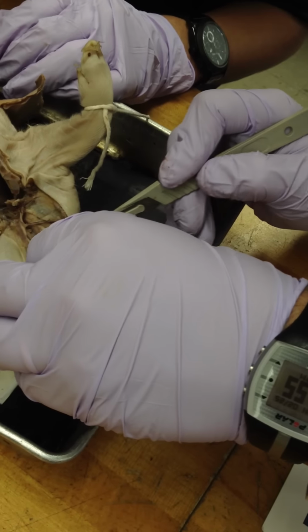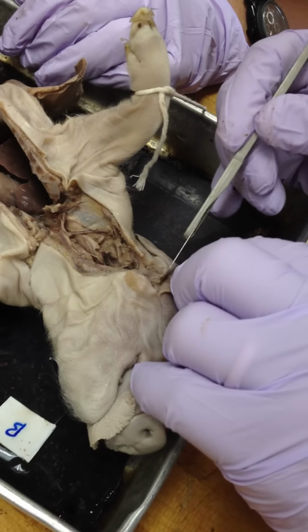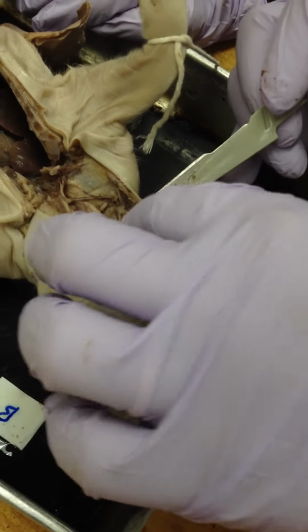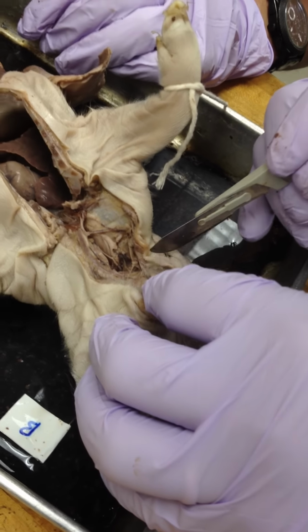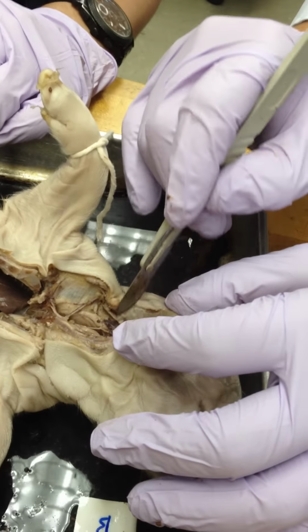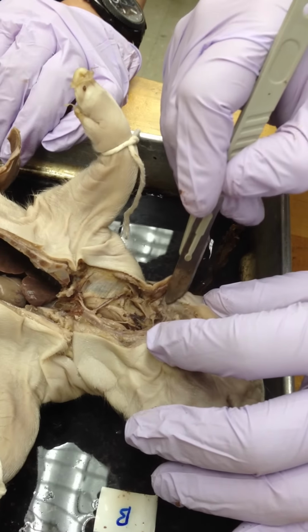Parotid. Where are those? They're right by the zygomatic arch in us, but on a pig, wait, do we even have those? What kind of parotid glands are those? Oh, absolutely. The parotid glands are the ones that are doing all the salivary fluid, not the mucus fluid, okay. That's when your mouth starts watering, this conditioned response, for example, Pavlovian conditioning.